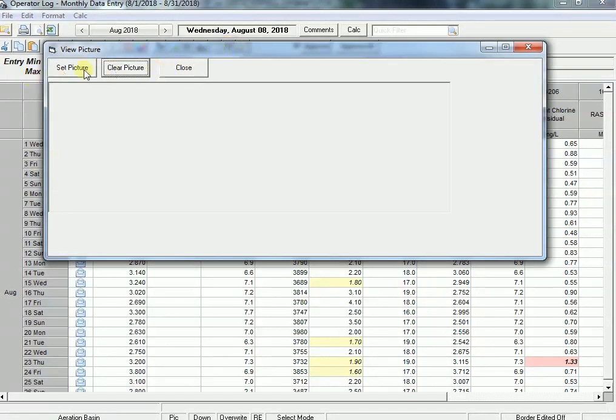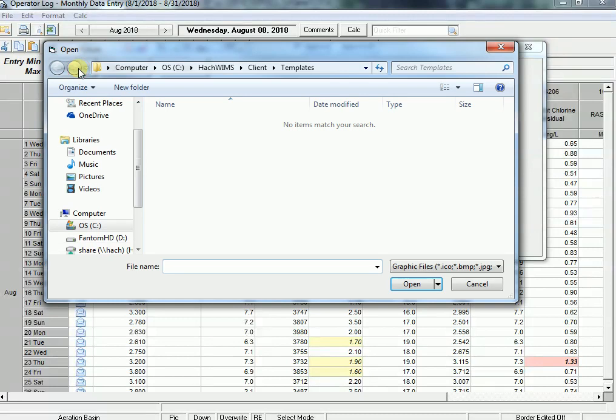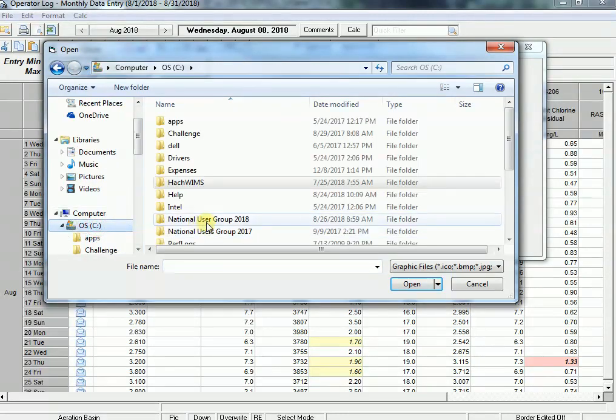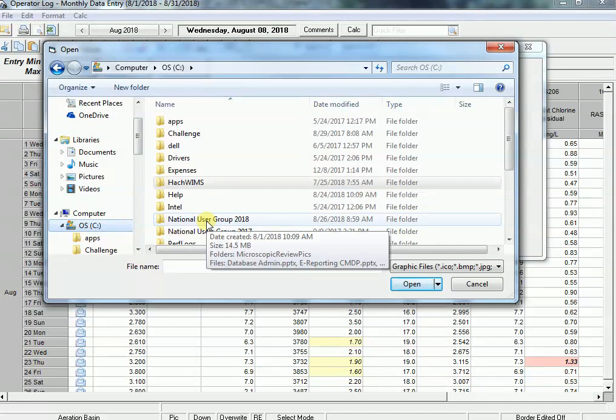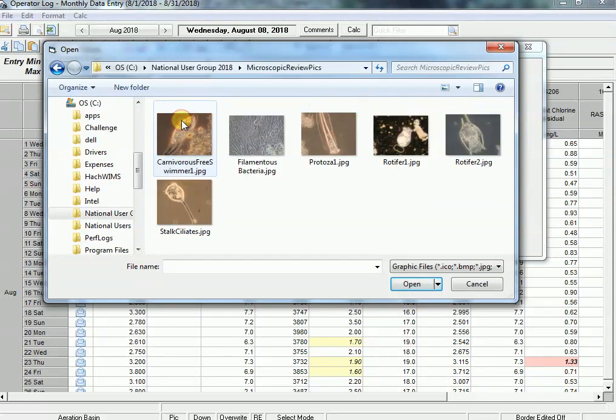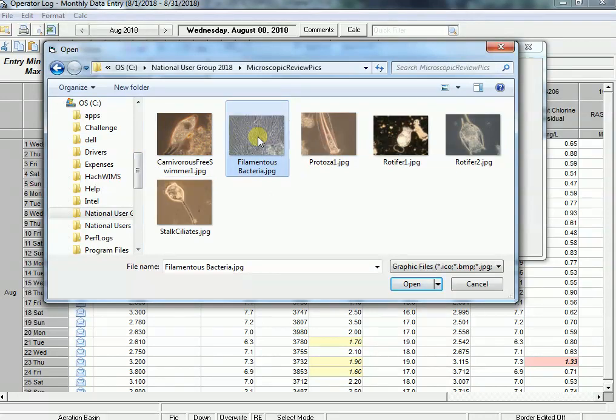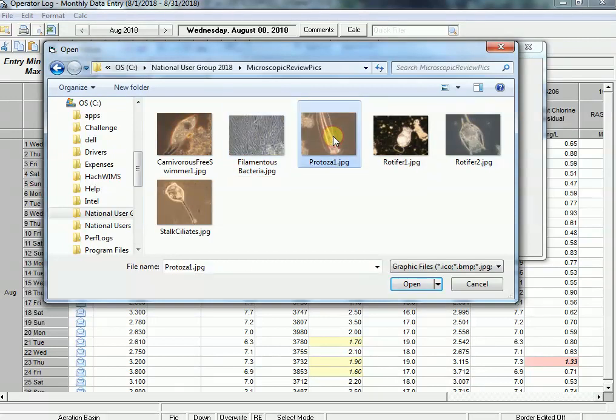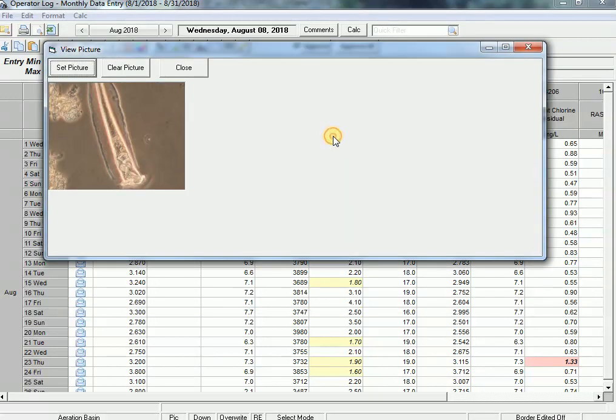And it says let's set the picture. I can browse to it. I'm going to go into my National User Group 2018 where we introduced this. I've got some pictures. On the Wednesday, it was a Protozoa, so I'm going to choose this JPEG.